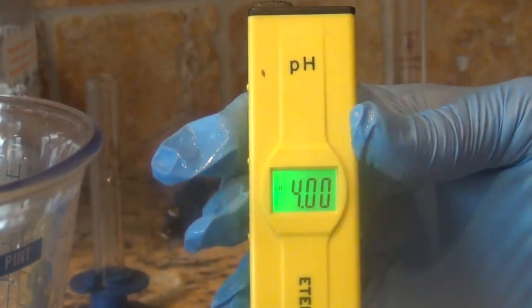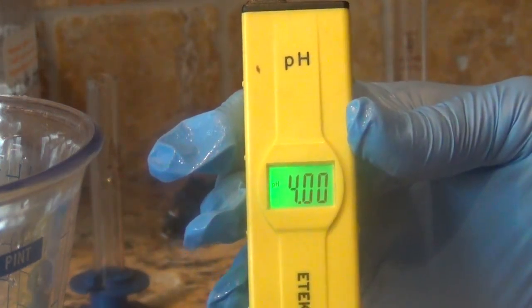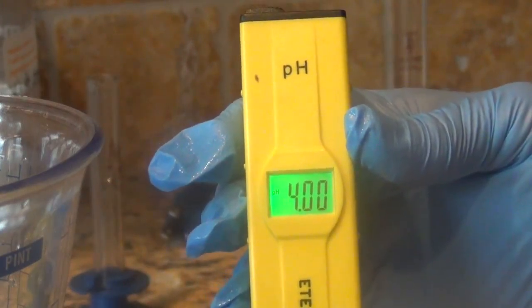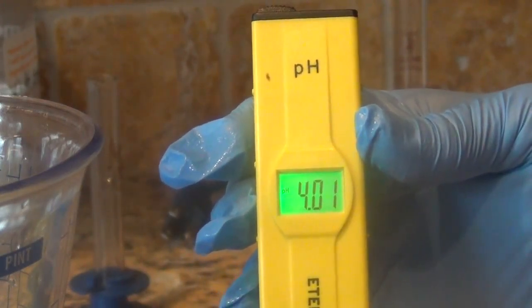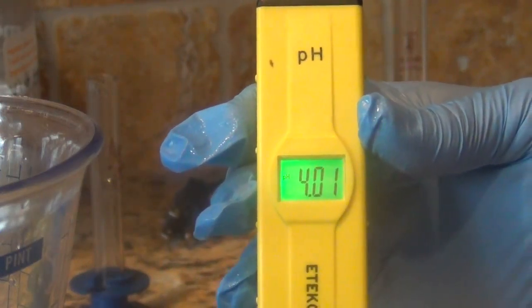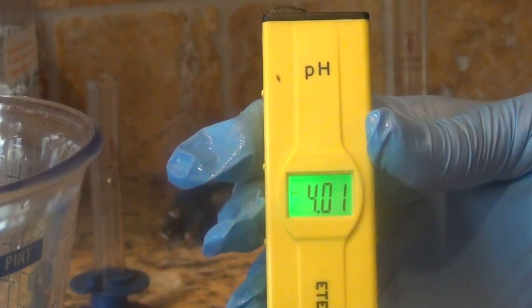If it jumps back and forth between 4.00 and 4.01, you want to try to figure out where it's holding the steadiest. So right now it's holding the steadiest at 4.0. When I move, the pH moves. That's how sensitive these things are.